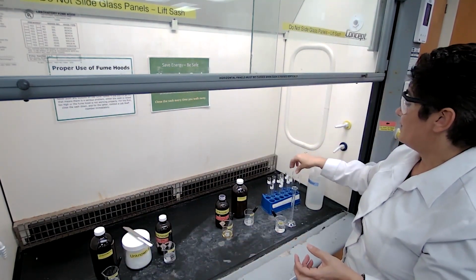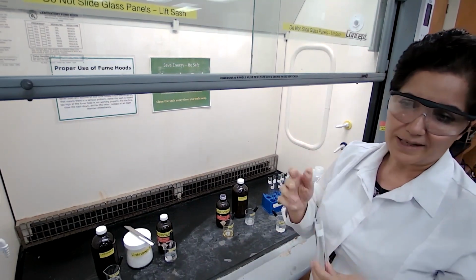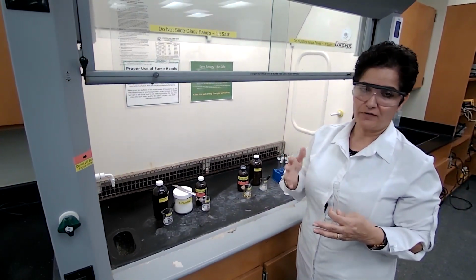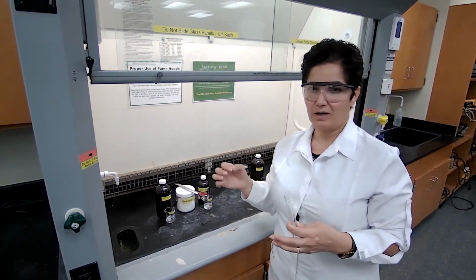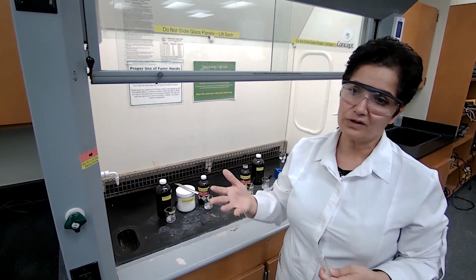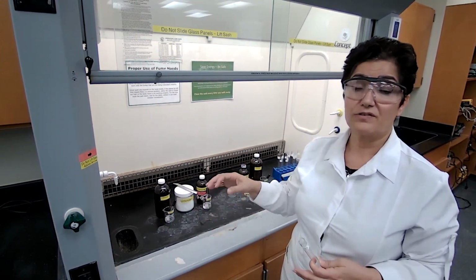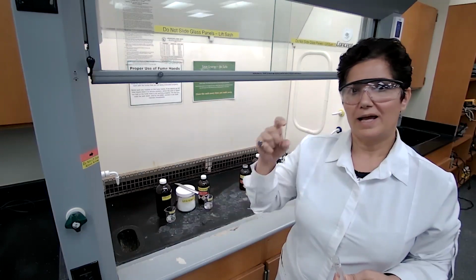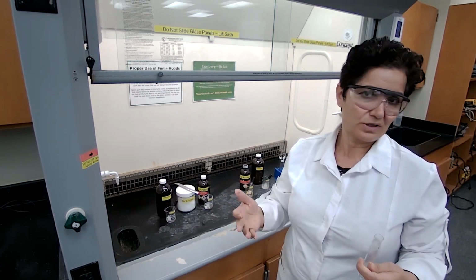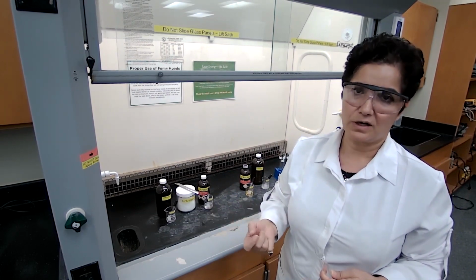Unknown 3 and unknown 5 are solids. For the solid, based on the procedure, we are adding about 0.1 grams. That ratio has to stay proper. If you use too much of the solid, even if the compound is soluble in the solvent, it will get saturated and there would be leftover solid and you won't be able to detect if it's soluble or not. For liquid unknowns, if you put too much of the unknown with a limited amount of solvent, if it gets saturated, partially it would dissolve and the leftover would form a second layer, and you don't know if the compound is soluble or not.